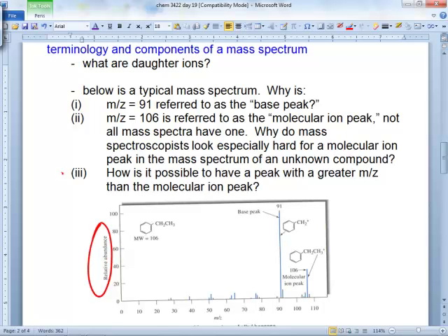Oh, we didn't answer this one. Molecular ion peak is right here. Well, if that's the molar mass of our compound, how is it possible? Oh, that's got to be an impurity, right? What the heck? It can't be an impurity. Remember, if whatever's in front of this detector did its job, that's pure analyte coming into this detector. There's no impurities here, so you can't say impurity.